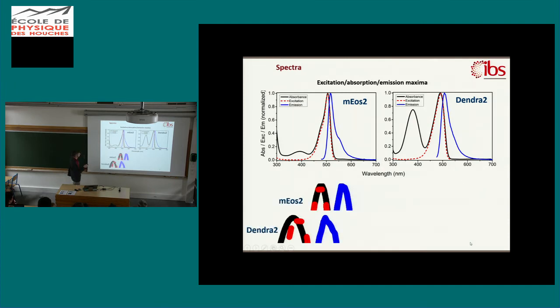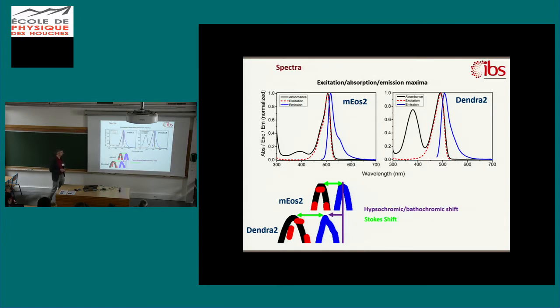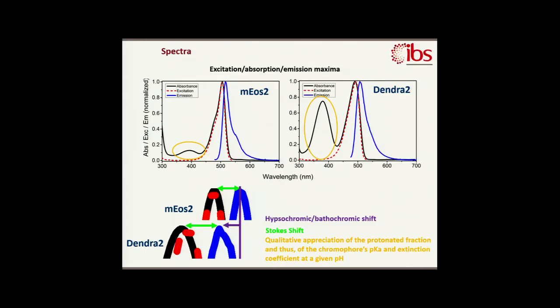If you zoom here on the top, you have these maxima, so it's really zoomed, but you have also other information, like whether you have a hypsochromic or bathochromic shift, so blue or red shift, between your proteins. Here it's a blue shift for Dendra2. So that's also important for making the good correspondence of your laser setup if you're imaging your sample. The Stokes shift, which is the spectral shift between the absorbance and the emission, is wider for Dendra2. And as I told you, the pKa must be different.